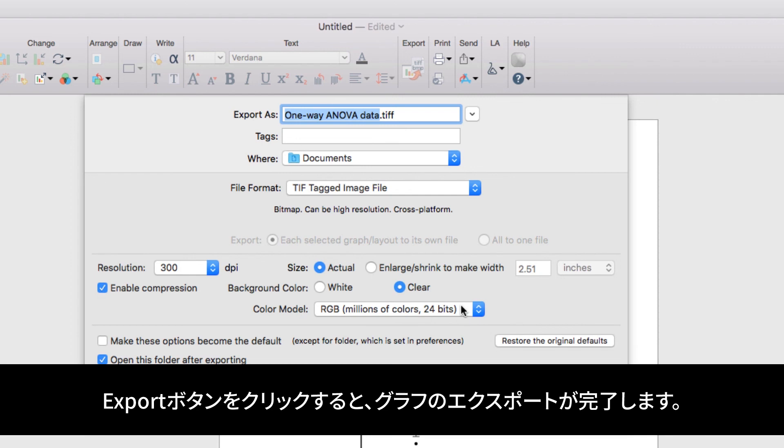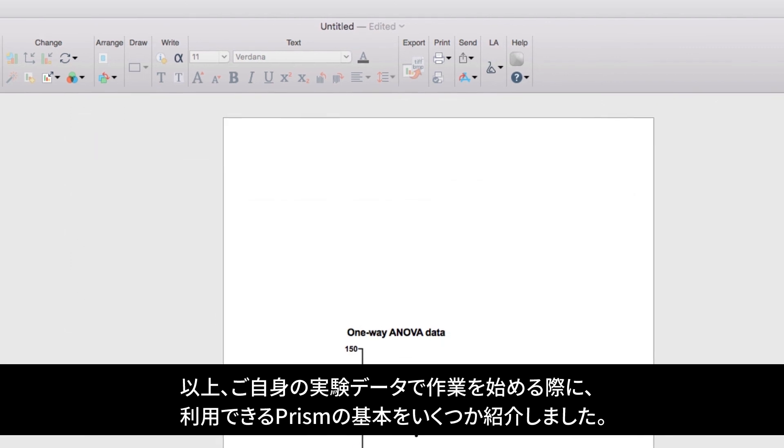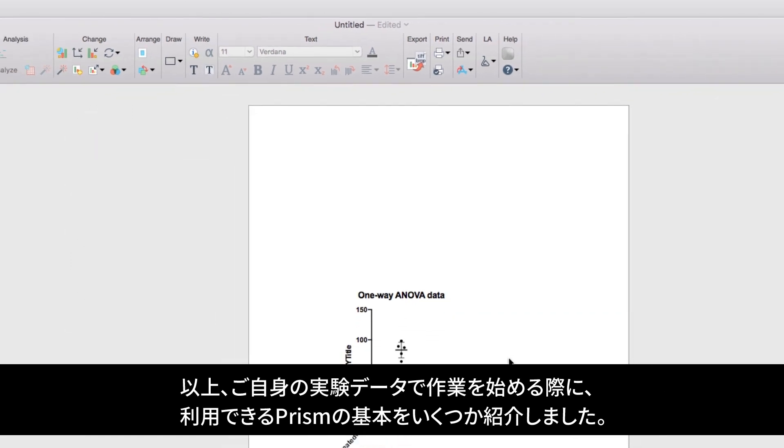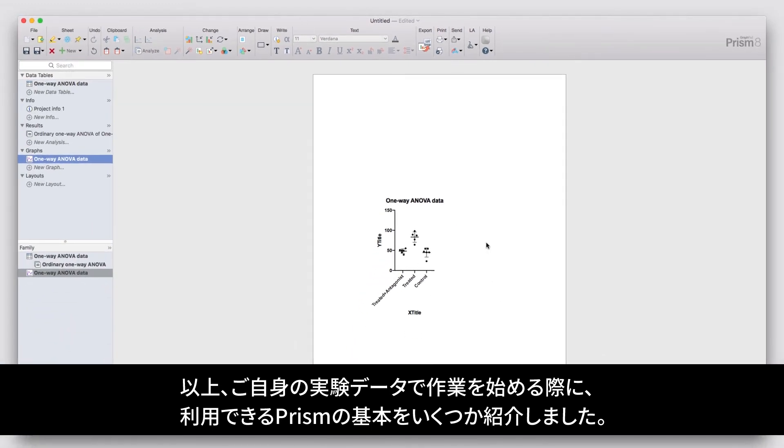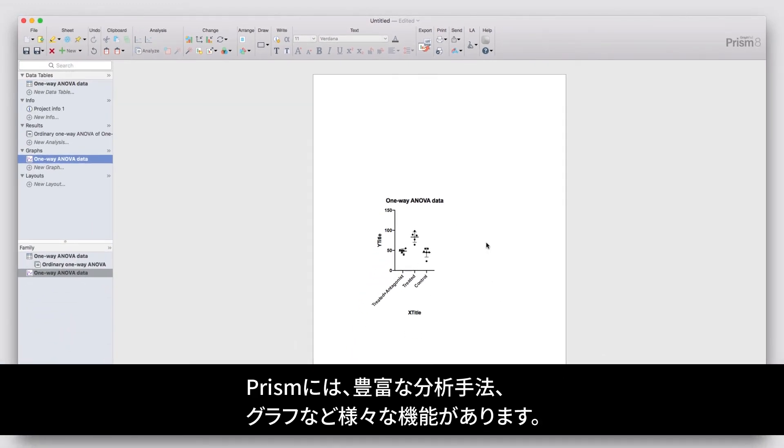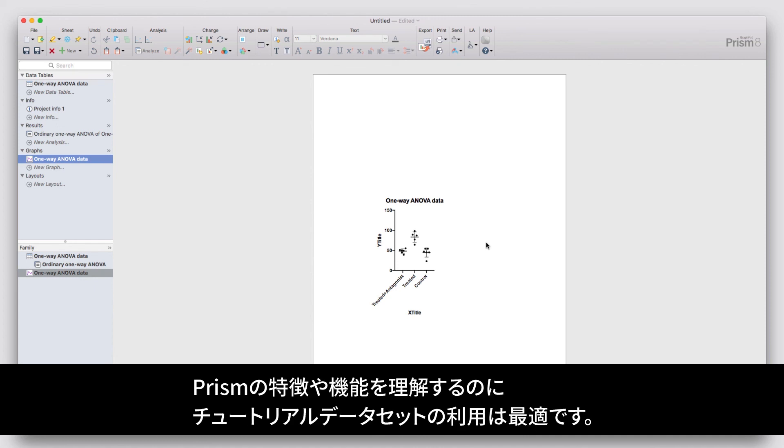So that's it! Those are some of the fundamental aspects of Prism that you can use to start working with your own experimental data. There are tons of other types of analyses, graphs, and features throughout Prism, and one of the best ways to explore those is through the use of the tutorial datasets. However, the basics always stay the same as you go from data to analysis to results to generating and customizing your own graphs.